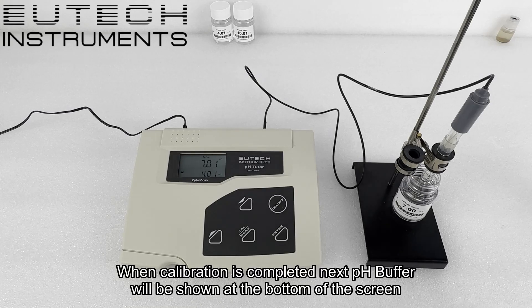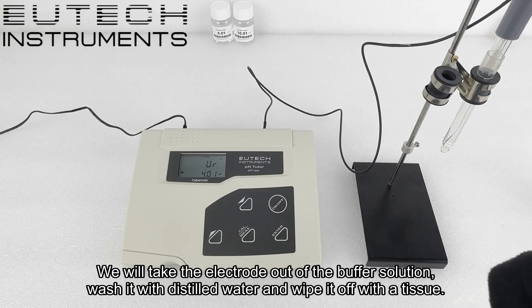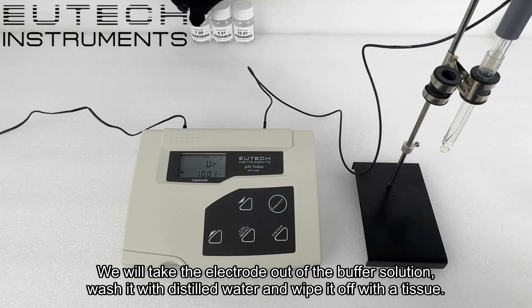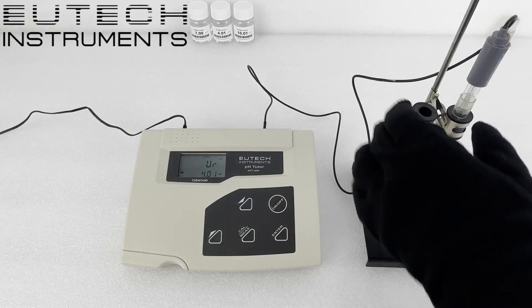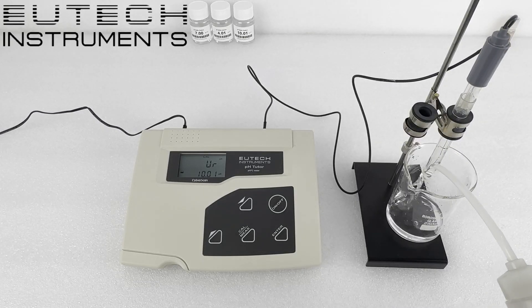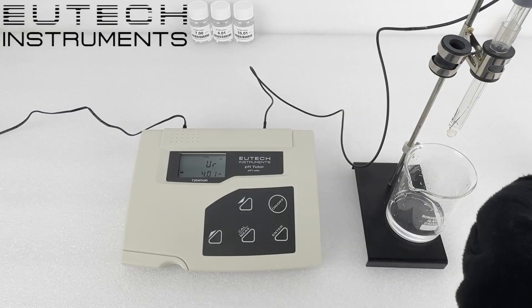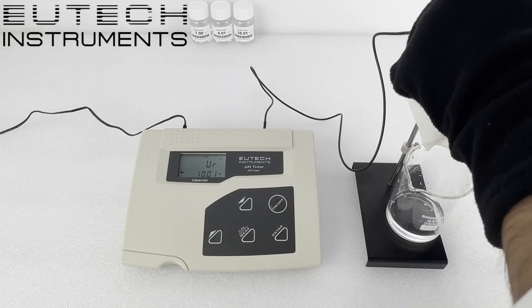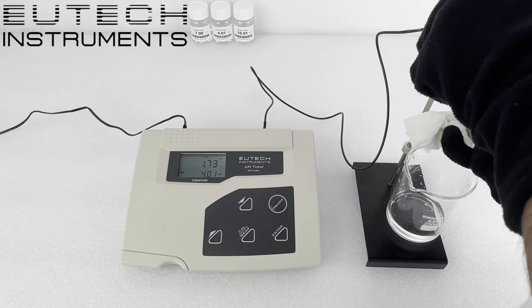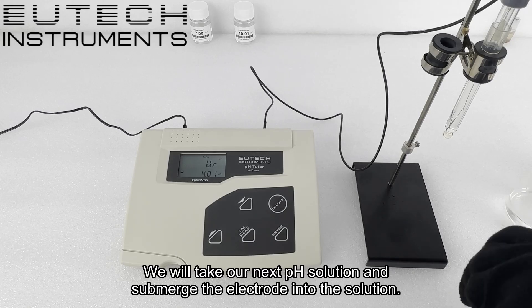When calibration is completed, the next pH buffer will be shown at the bottom of the screen. We will take the electrode out of the buffer solution, wash it with distilled water and wipe it with a tissue. Then we will take our next pH solution and submerge the electrode into the solution.